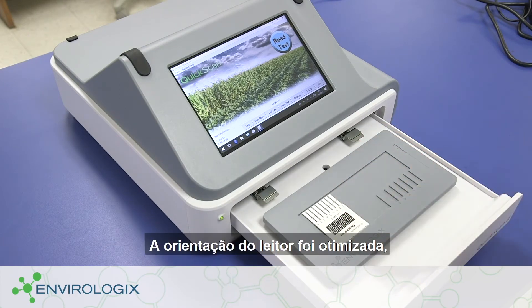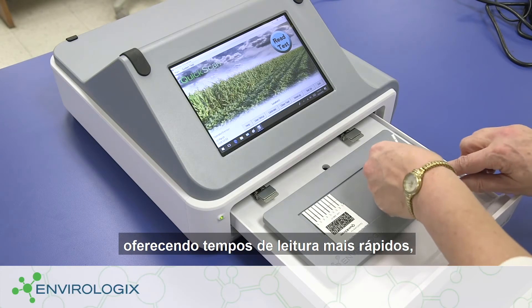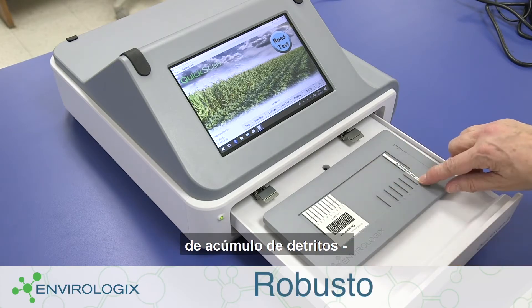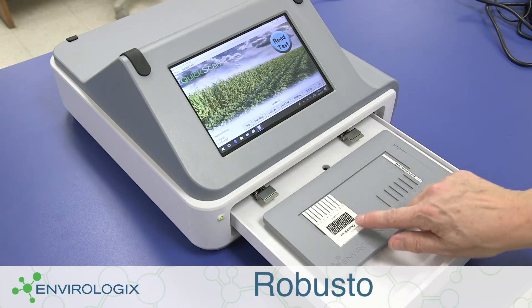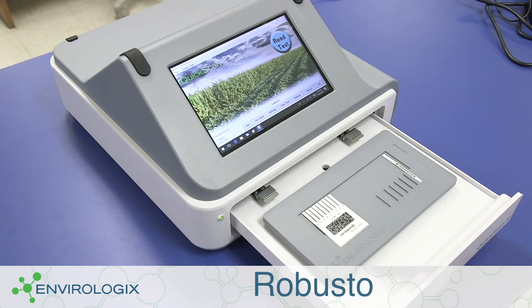The scanner orientation is improved, offering faster reading times and fewer opportunities to accumulate debris, which means less cleaning for you.